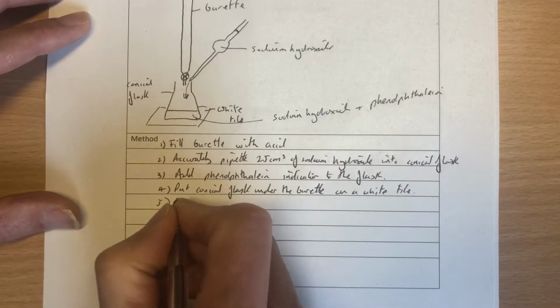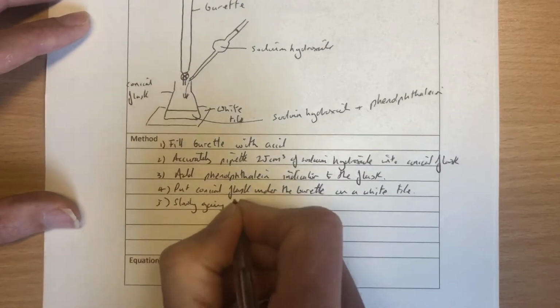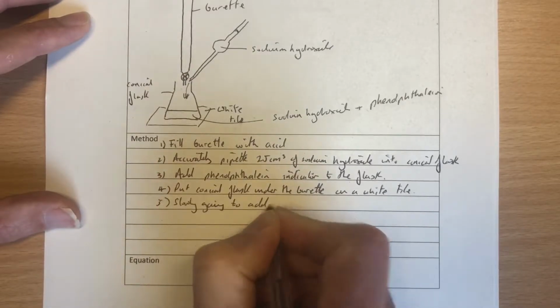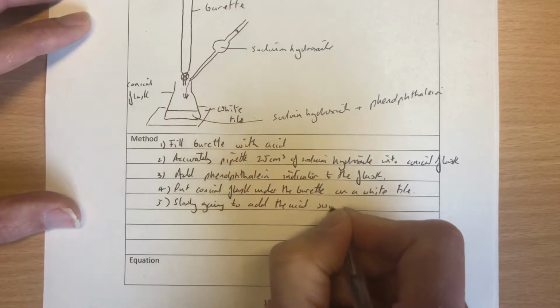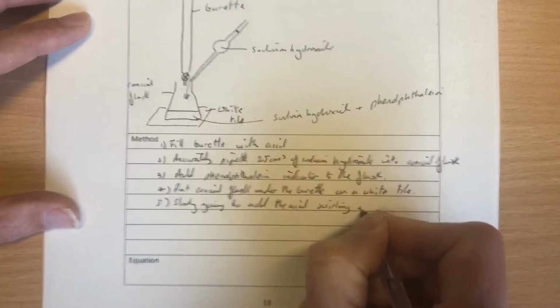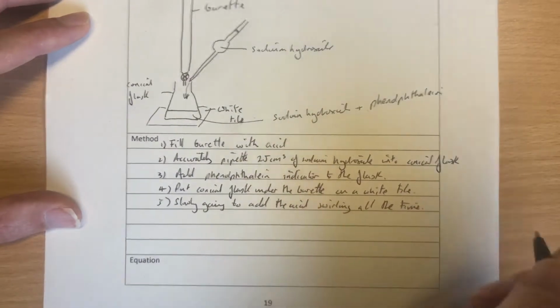5, we're slowly going to add the acid, swirling all the time. We swirl it to make sure the acid reacts with the alkali nice and quickly.